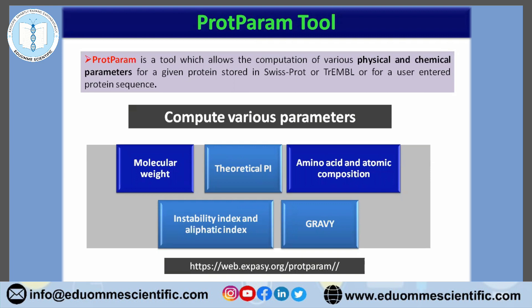So in this tool, you can compute various parameters like molecular weight, theoretical pI, amino acid composition of a particular peptide and protein, atomic composition, half-life, instability index, aliphatic index, along with the GRAVY values. ProtParam is very useful to compute various physico-chemical properties that can be deduced from a protein sequence or peptide.